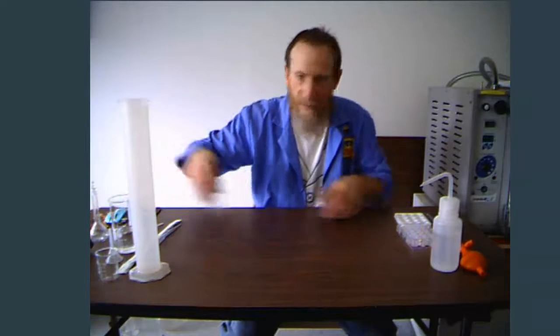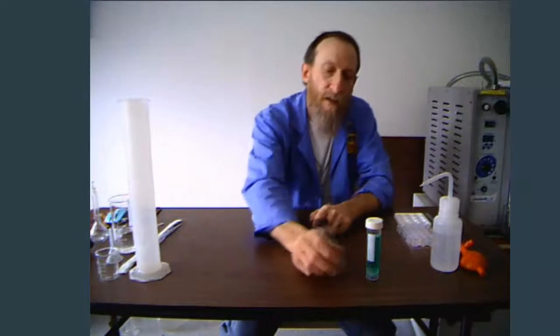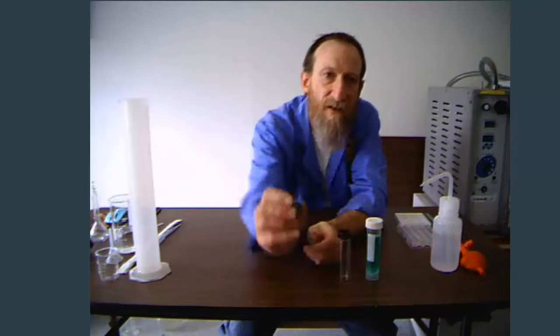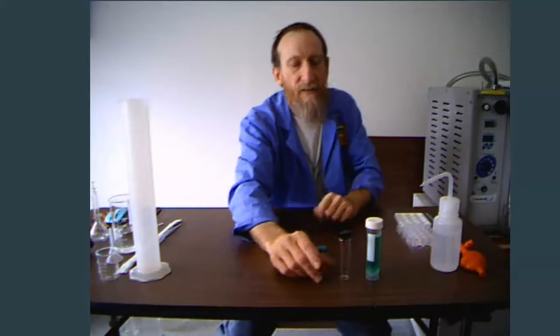We have other various types of containers. This is a plastic screw top vial, and here we have a glass screw top vial — often called reaction vials because chemical reactions take place in them. There is a smaller one as well. This one actually has a Teflon coating on the inside of the cap, so you can carry out a chemical reaction without it reacting with the vessel or vial.